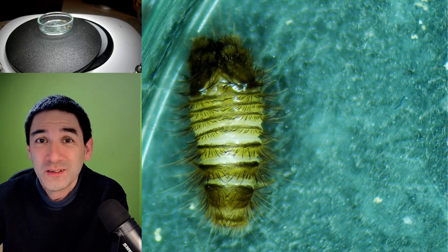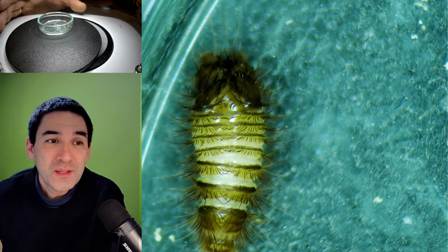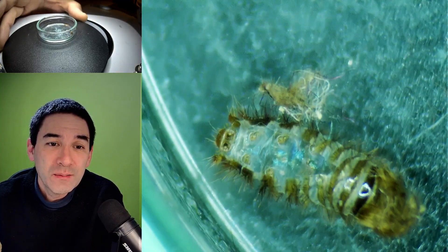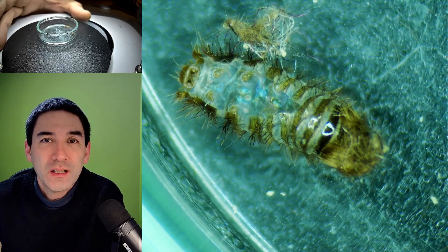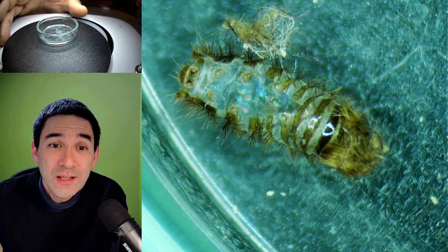So it's still crawling around happily, more or less. But look, there's something else that I found here — this is the skin of the carpet beetle. It molted, it shed its skin off.